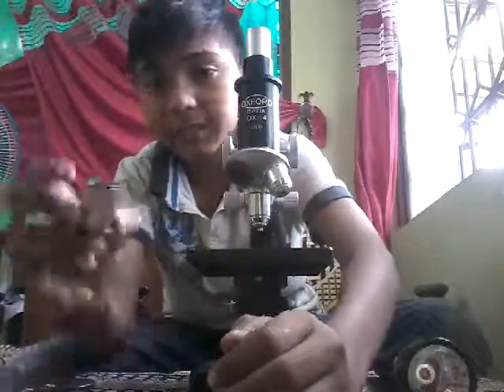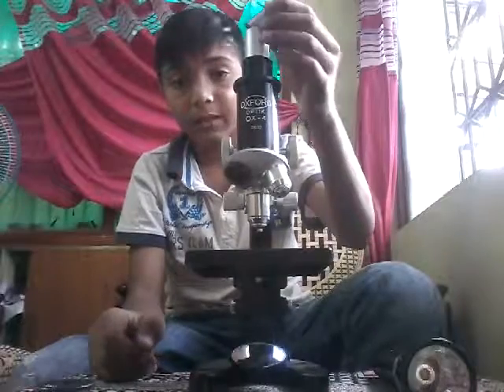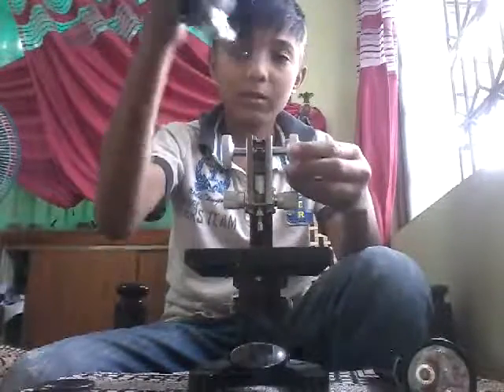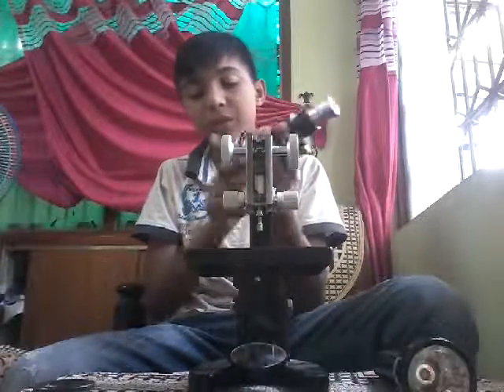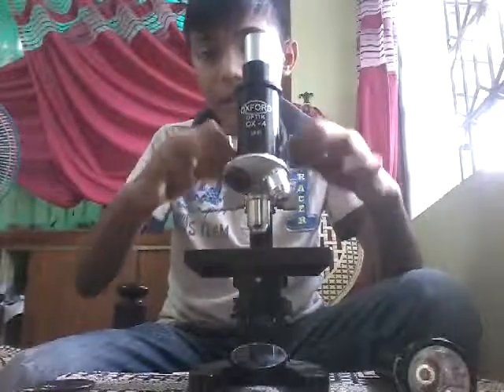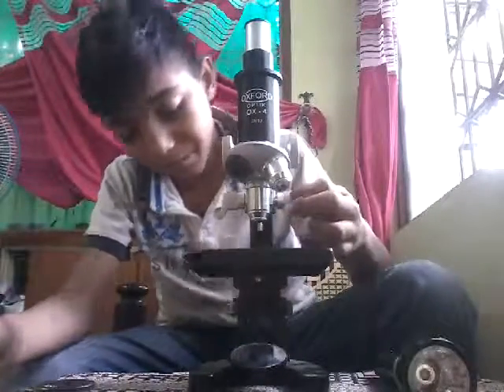I'll take the 15x one, and I'm going to keep it like this. Now you can see from it. You can remove this also, guys. See, guys, you can remove it. Any dust came in, you can wipe it from below up. Again, you can keep it. See that? It is for magnifying and minimizing, guys. And this is for focusing, okay, guys?